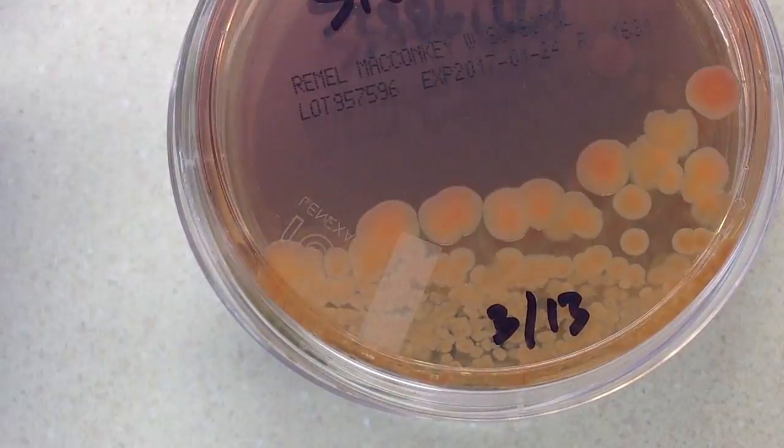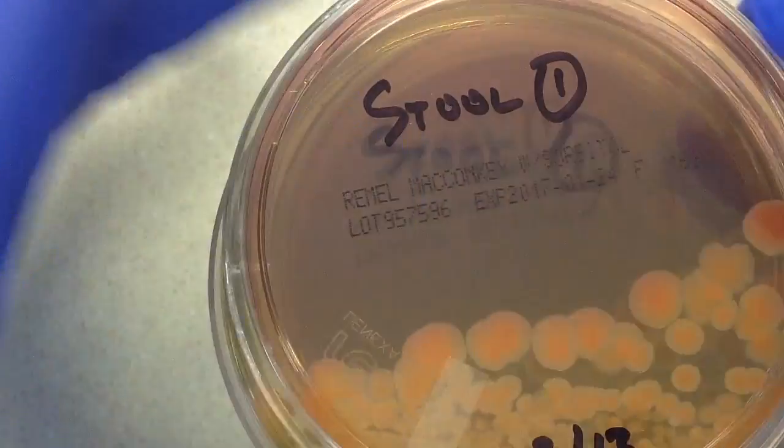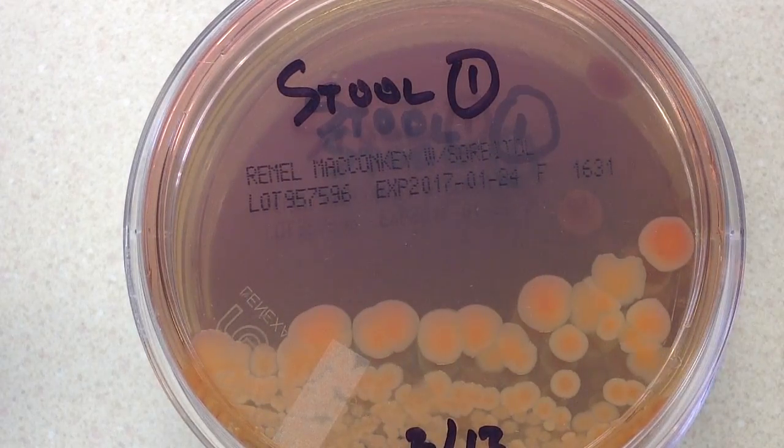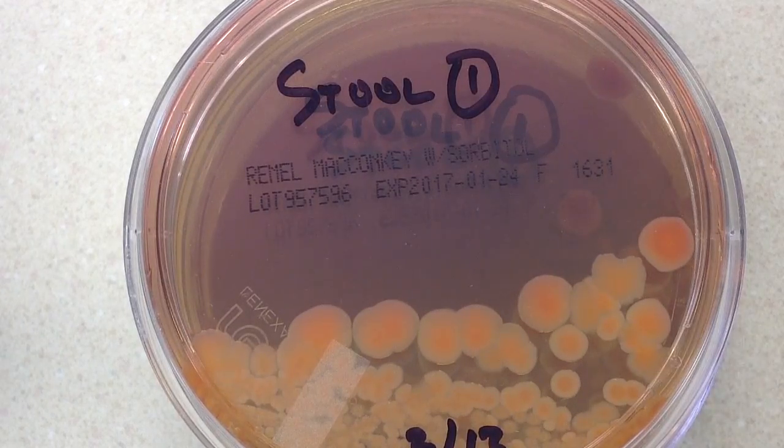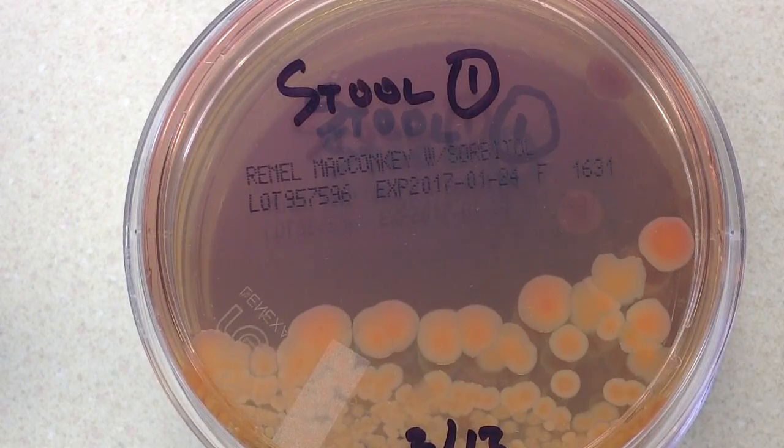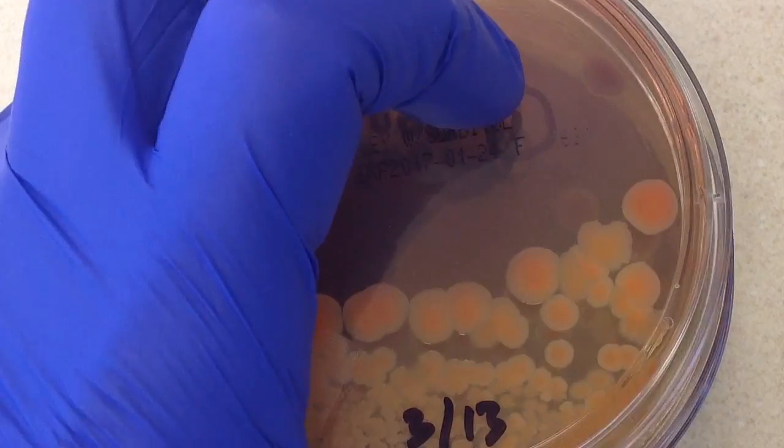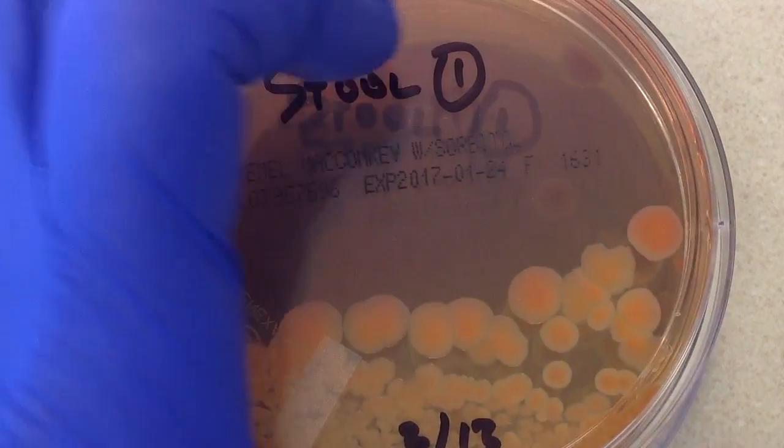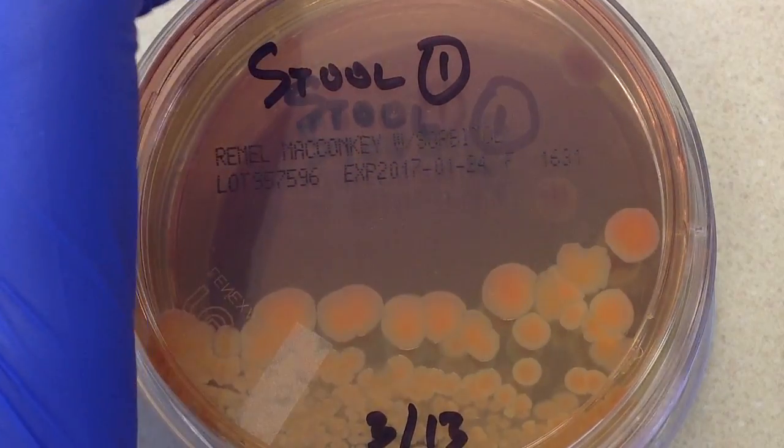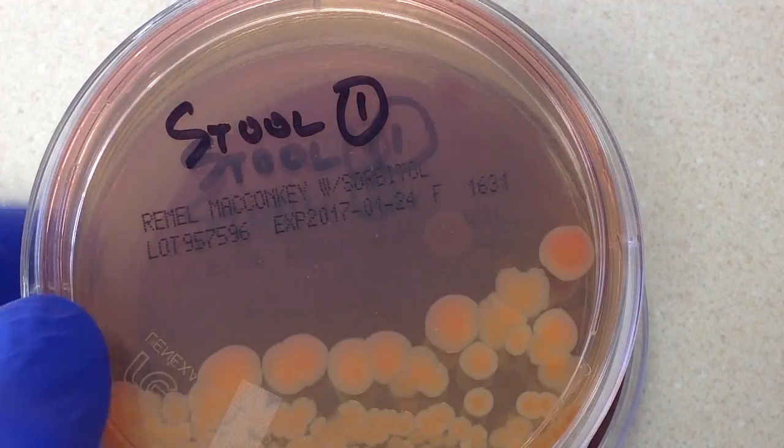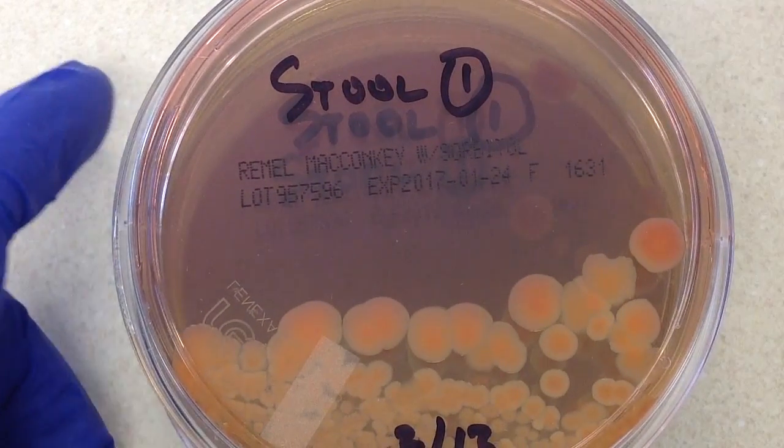We've looked at all the plates. In this video, I'm not doing a campy plate. I don't have a campy incubator in my student laboratory here, so we're not going to work that one up. This looks like a normal stool culture to me. I'm going to send out, this has been incubating for two days, I'm going to send out a final report. First of all, we're going to say how much. I could say that we have a moderate amount. So my report is moderate normal stool flora, no pathogens present.